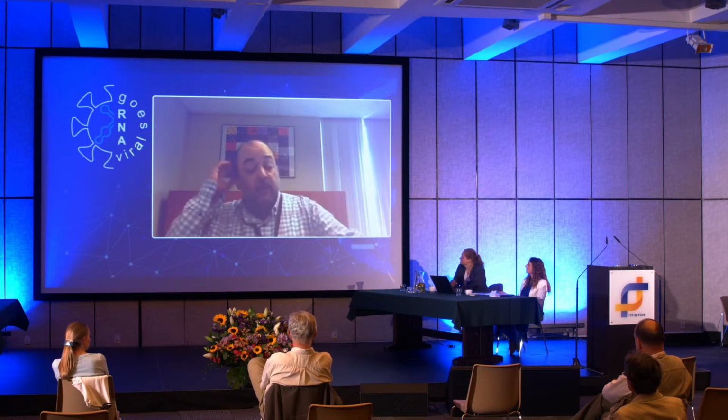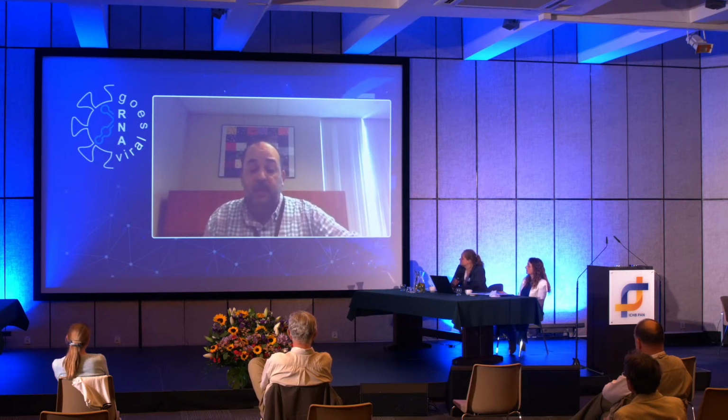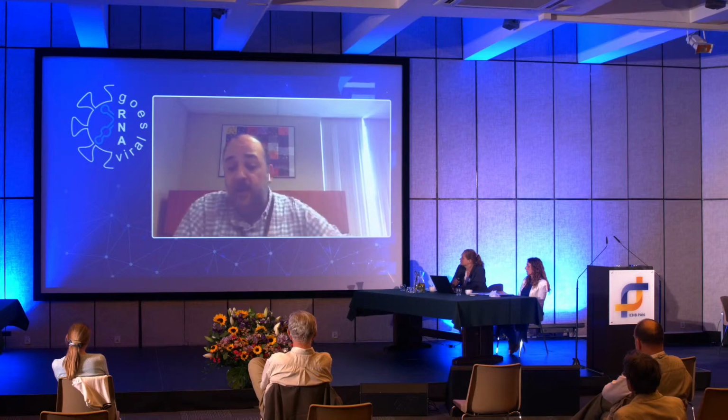Yeah, that's a great question. Since we developed these reporter viruses, as you can imagine, they are more compatible with high throughput screening approaches. We are testing antivirals, we are testing neutralizing antibodies, with the advantage that you can use this reporter as a valid surrogate of viral infection, meaning you don't need to use an antibody to detect the presence of the virus.